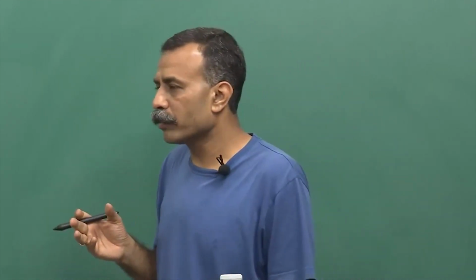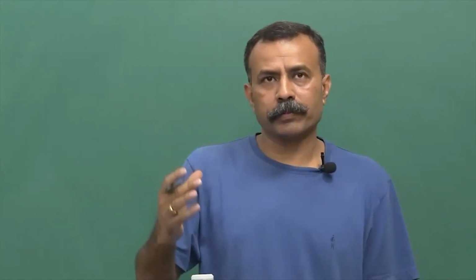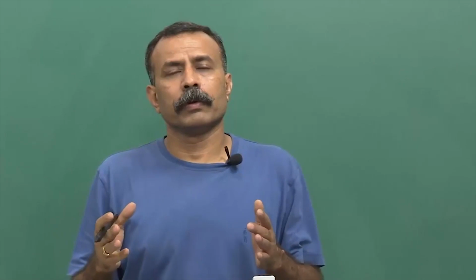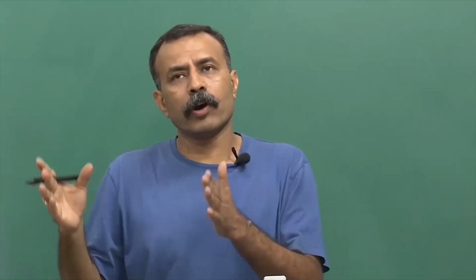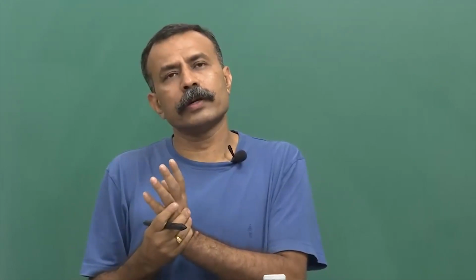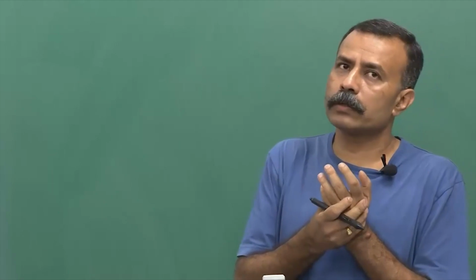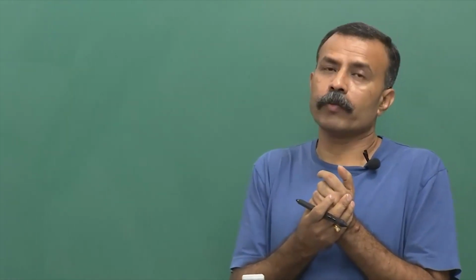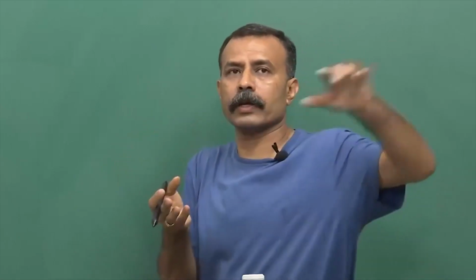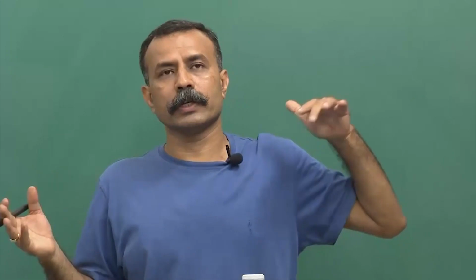and in the end we talked about to have a camera setup along with the basic setup of the microscope, and the need for having a monitor along with image processing softwares, which partly will be provided by the microscope makers, and rest you may have to have a Photoshop or something installed in it where you transfer the images, or if you want to make a video, what all facilities you have.